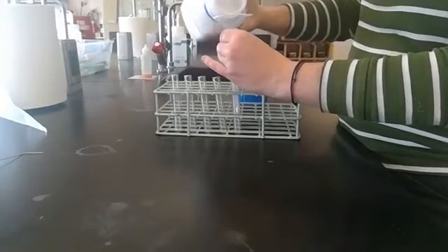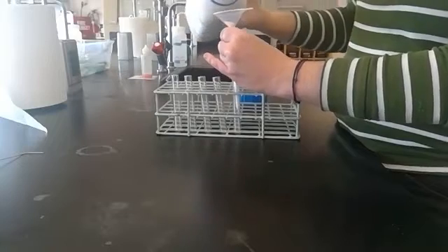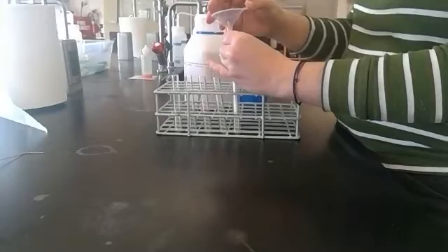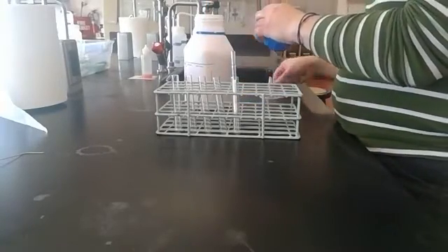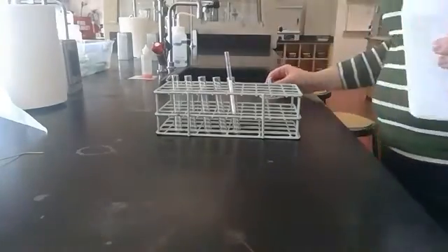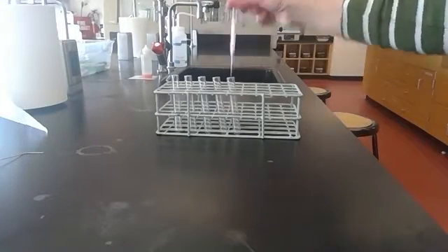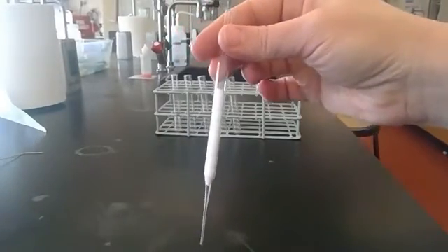I actually honestly just got off Amazon. It's like lab grade. So I'm just going to put a little bit in. I'm not going to worry about an extremely long column. And so you can see I've filled that silica gel. And now I have a column for column chromatography, a really small one.